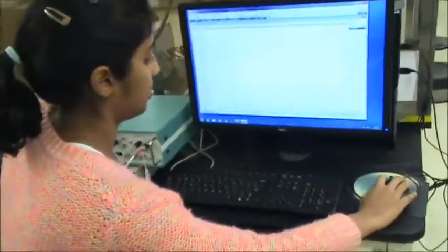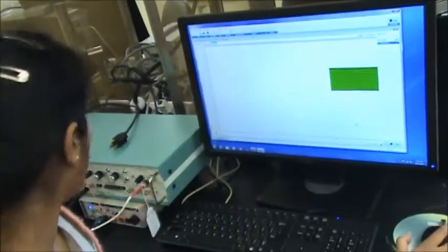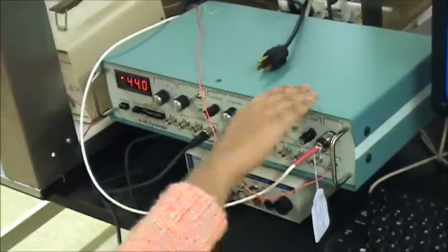So then you can just hit start, and you can see all of this, right? And that's because we still have our electrode test on. So if we turn that off, then you could see the baseline.